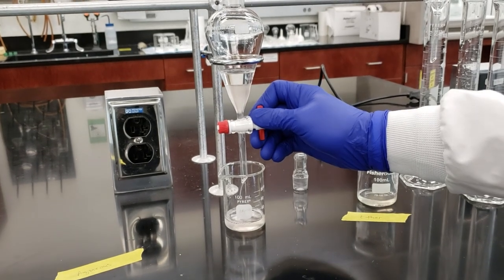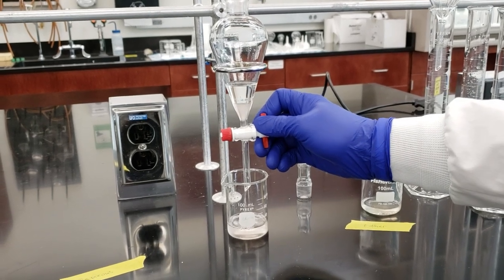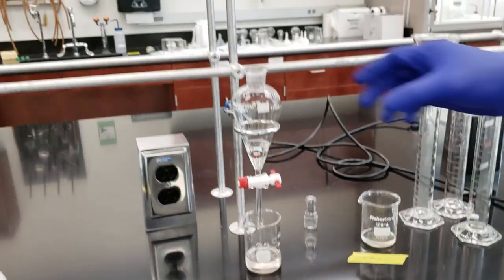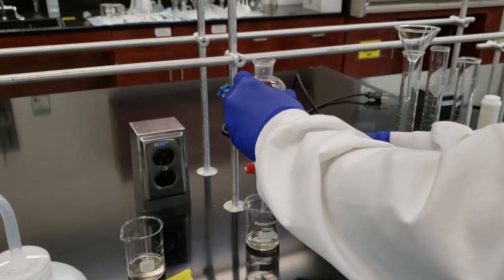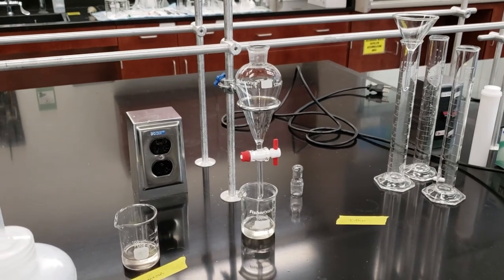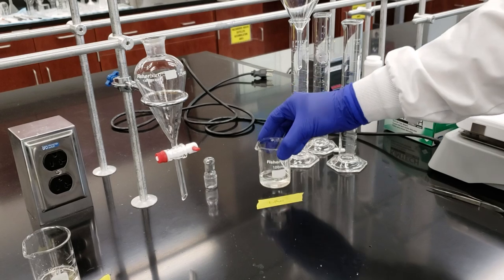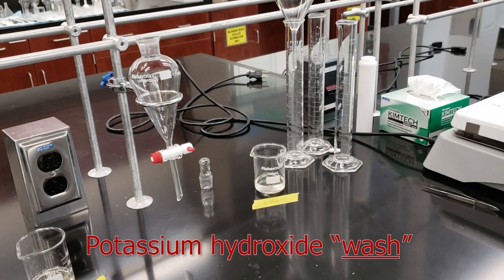And remember, this is an extraction process. So the idea here is that we are extracting our final product out of our aqueous reaction mixture and into our organic diethyl ether layer. Okay, so our aqueous layer is now separated. We're going to combine the two ether layers. Now that we've combined our two portions of ether, we're going to pour it back into the separatory funnel and begin our potassium hydroxide extraction. We'll measure out our potassium hydroxide solutions and continue from there.